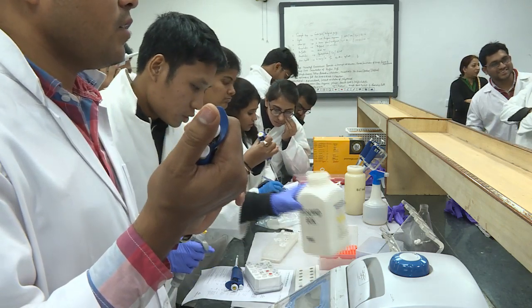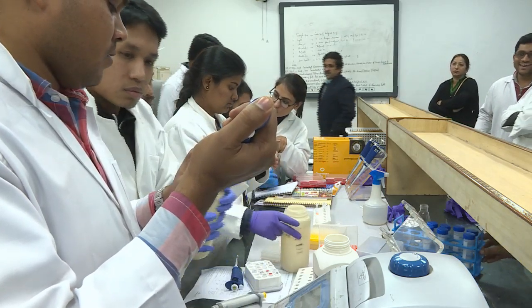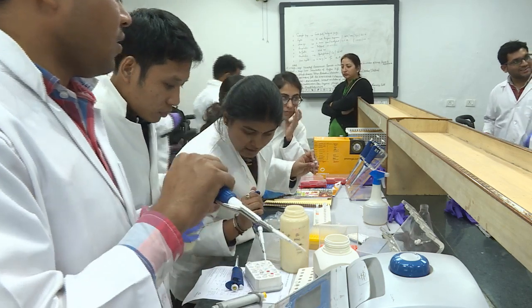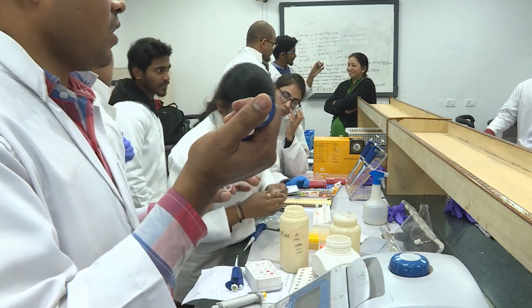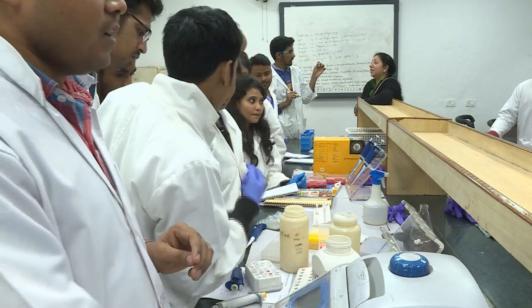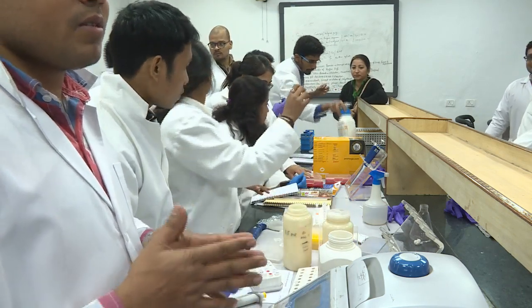Both are 16S. 16S is there. Did you add it, sir? Yes, do it. No sir, this is the last one. Here sir said 16S is okay. Ten minutes earlier sir said it's okay, 16S only, for both, for Ralstonia, for both. Not for primer also, they said.